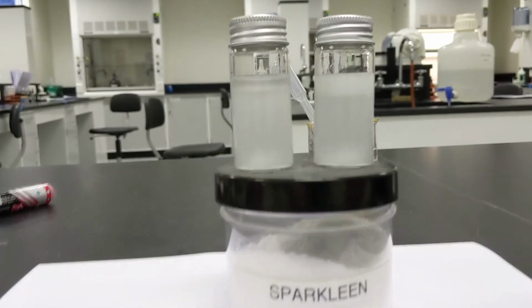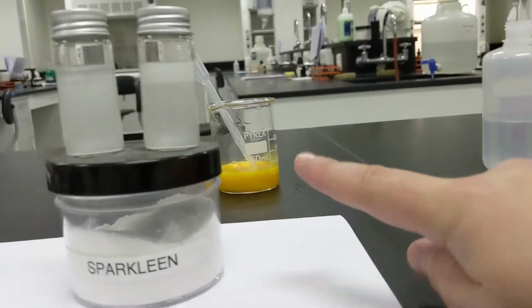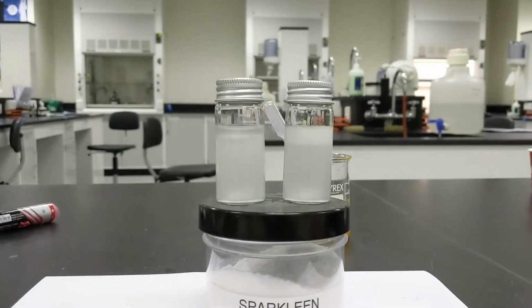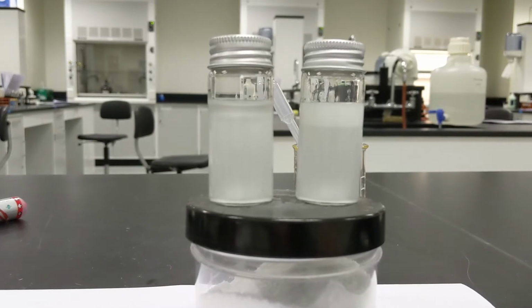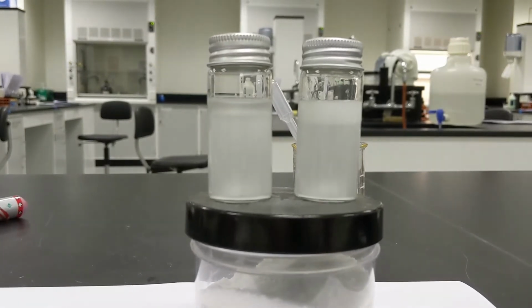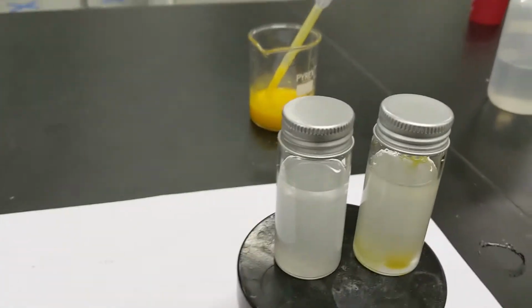So my goal now is to add some soap to the left one. I'll add some egg yolk to the right one, and we'll see what happens. And again, even now you can start to see them really begin to separate. So I'll add a pinch of these off camera, give them a shake, and we'll watch what happens.